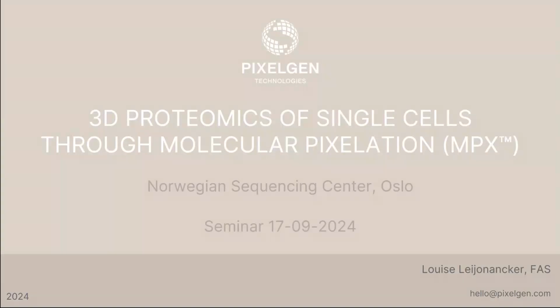3D proteomics of single cells through molecular pixelation. And the three-letter acronym we have is MPX. So if you hear me talking about MPX, it's just about the technology.